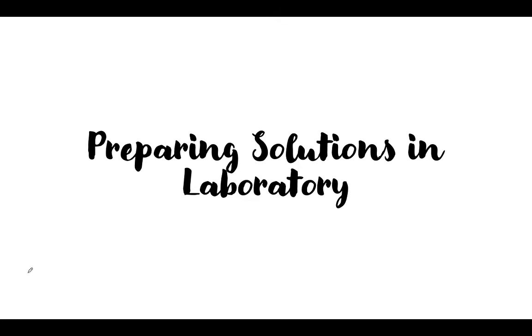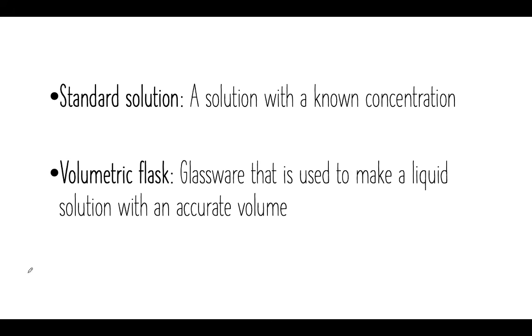Right, in this video, we're going to learn how to prepare solutions in a lab setting. There are two methods to making solutions in a lab setting, but before we get into that, we need to learn about some terms that you're going to hear often in this video.